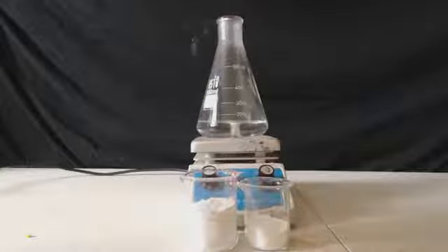John Black, super chemist. We're here to make some potassium sodium 2,3-dihydroxybutanedioate. A lot of people call that Rochelle salt. What do I got here? I got 47 grams of cream of tartar, and I got 13.25 grams of sodium carbonate.